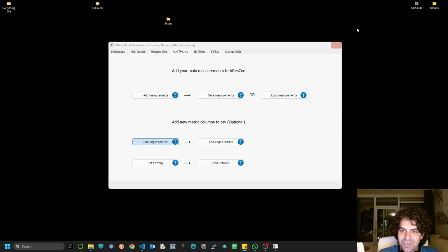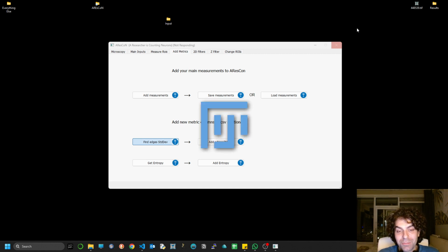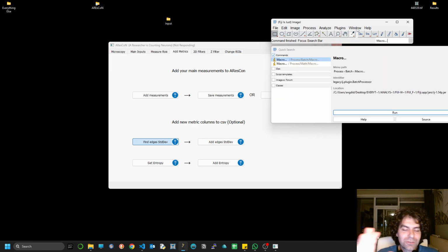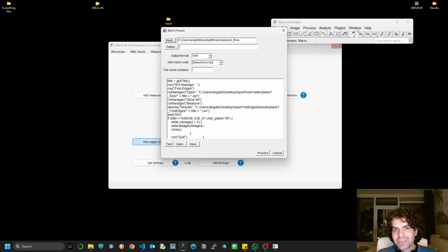So imagine that Fiji gets stuck, all these steps will still keep running on your PC. If you start opening folders, it could be that Control C is pressed, and this can really mess up the things that you're doing. So if something is going wrong, don't worry, because there's no possible case that a click will be made by itself and files will open if something goes wrong.